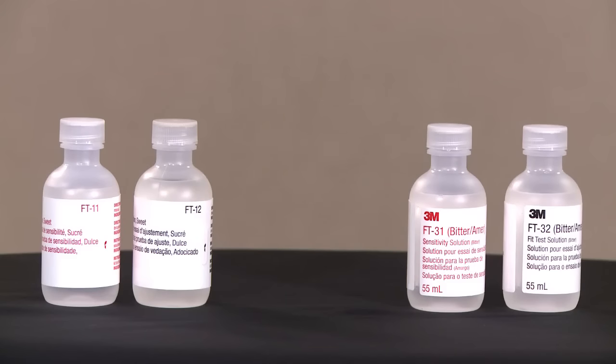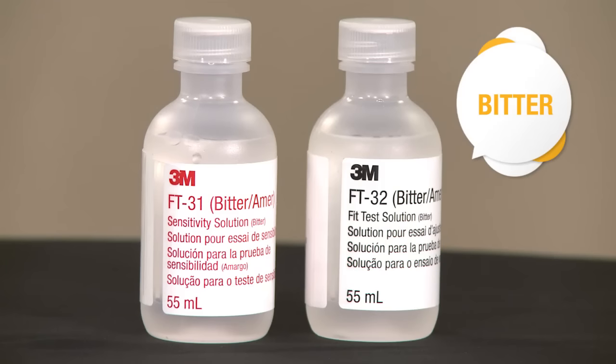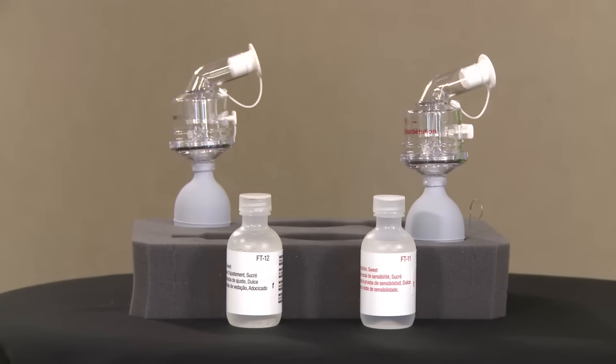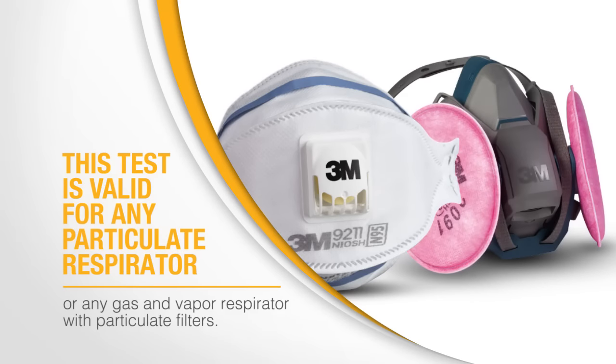One type of qualitative fit test can be performed with a mist that contains either saccharin, which is a sweetener, or a bitter-tasting substance known as Bittrex. The test process is the same for both test agents. Your instructor will tell you which material will be used for your fit test. This test is valid for any particulate respirator or any gas and vapor respirator with particulate filters.